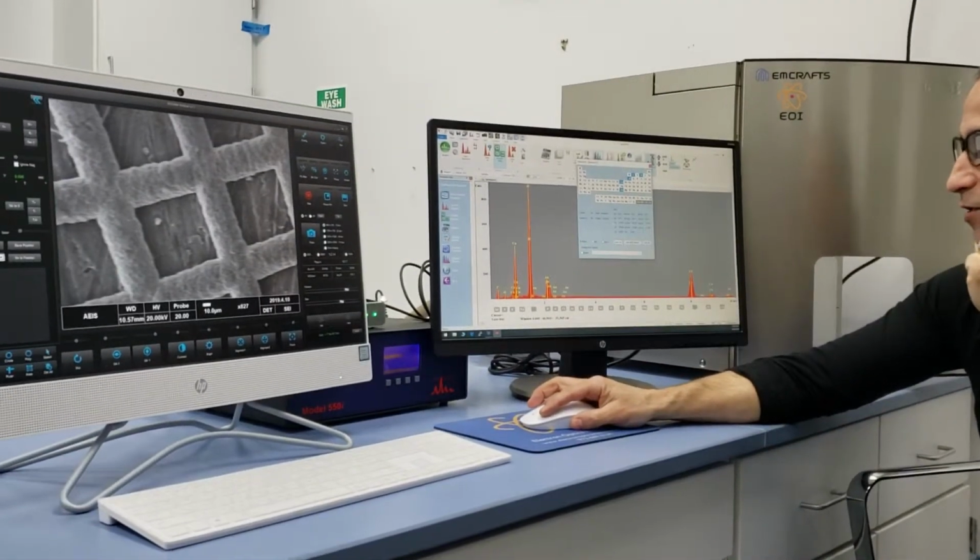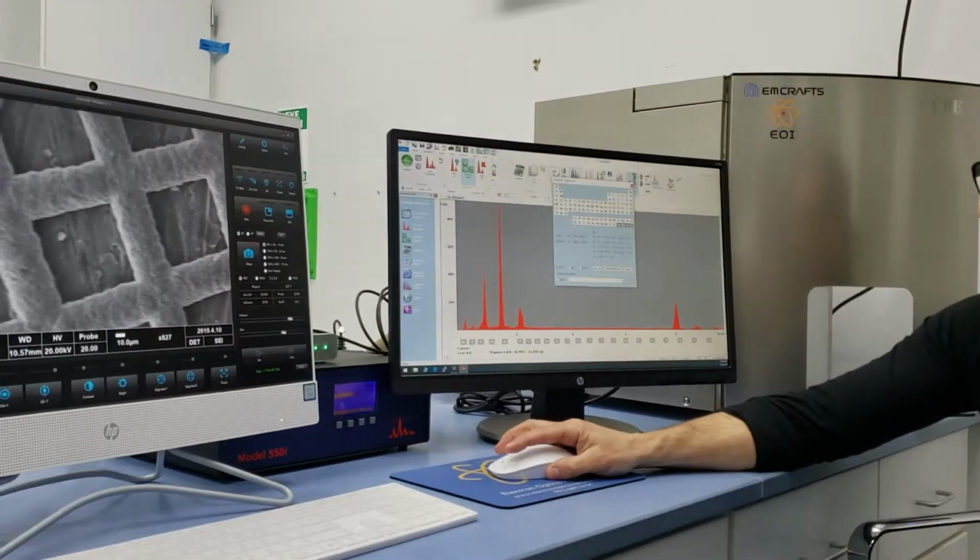Okay, now I'm going to erase what I just did. See, I'm going to clear list. Okay, this got cleared.